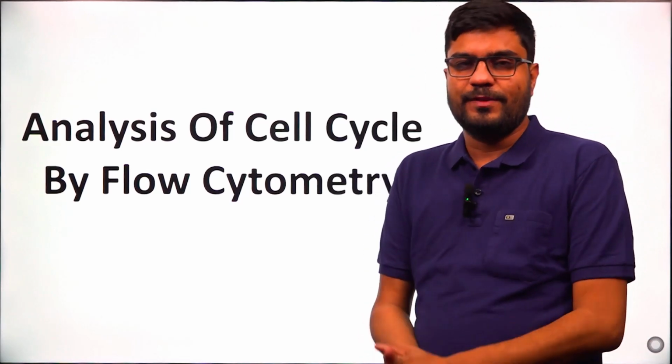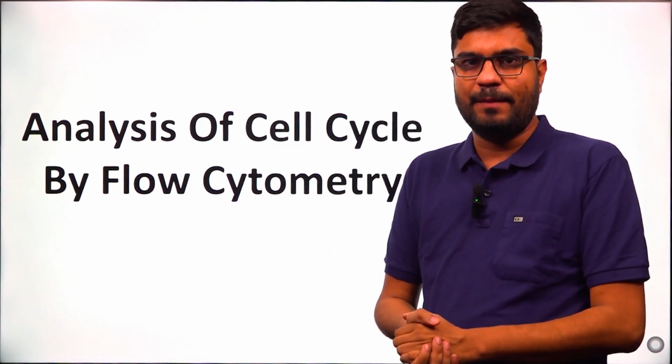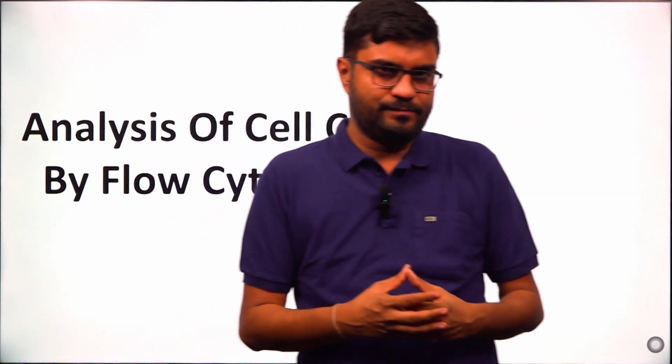Hello guys, today I am going to discuss a very important application of flow cytometry, that is how do we analyze cell cycle by using a flow cytometer.